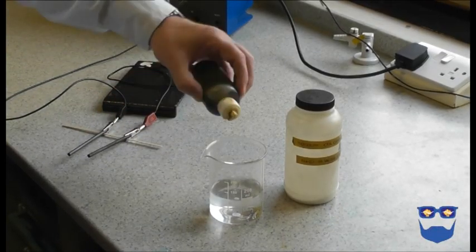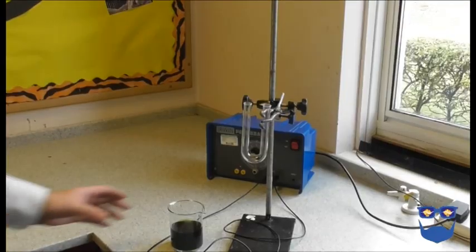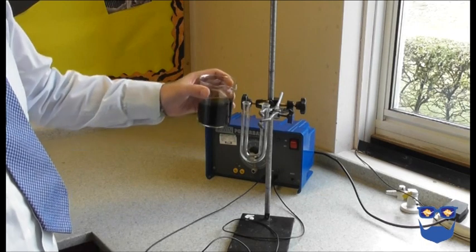Add some universal indicator. You need a strong enough color. Pour the electrolyte then into your U-tube and insert your electrodes.